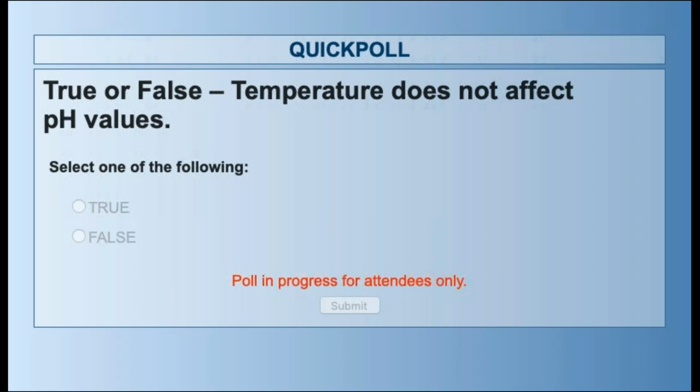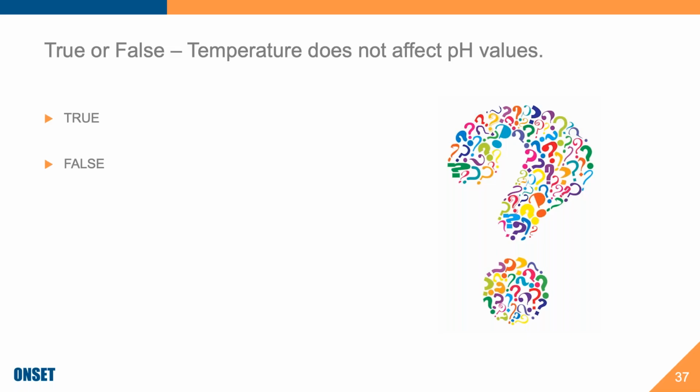Much quicker response. Okay, so the answer is false. Temperature does affect pH, and it is a rather important part of the pH measurement. So it is really, really important that temperature is mitigated or monitored.